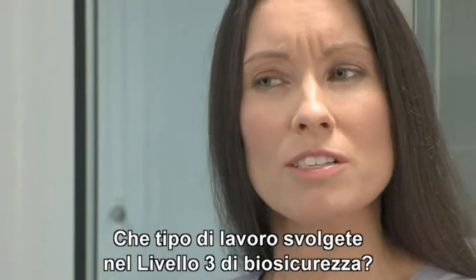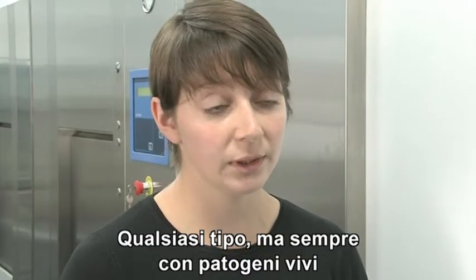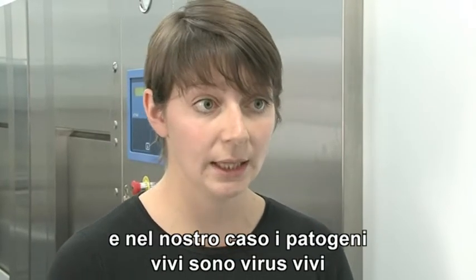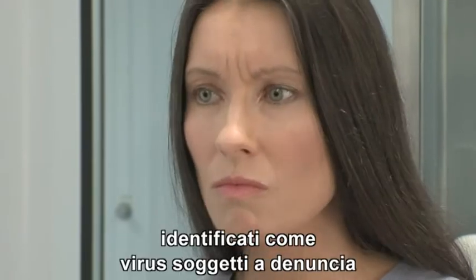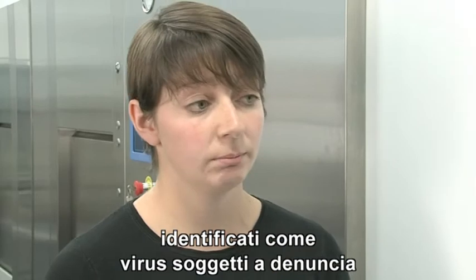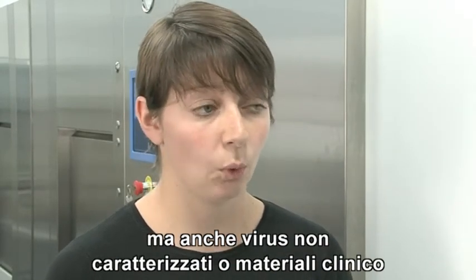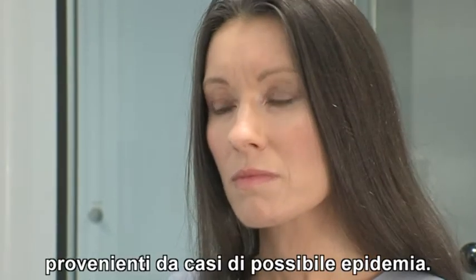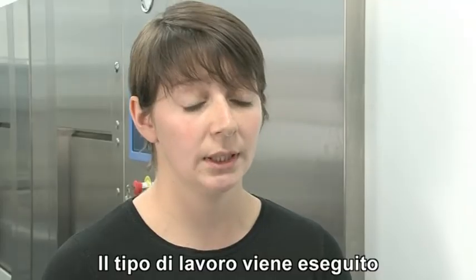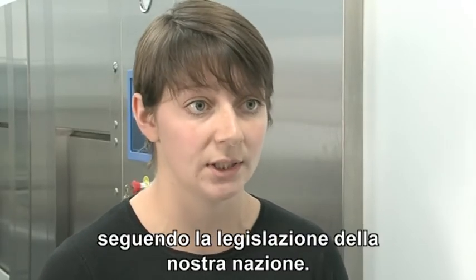What type of work is undertaken in biosafety level 3? Any type of work, but it's all with live pathogen, and in our case the live pathogens that we're working with are live viruses that have been identified as notifiable viruses, but also uncharacterized viruses or clinical material from potential outbreak cases. So this work is specifically undertaken at this level of containment following our country's legislation.